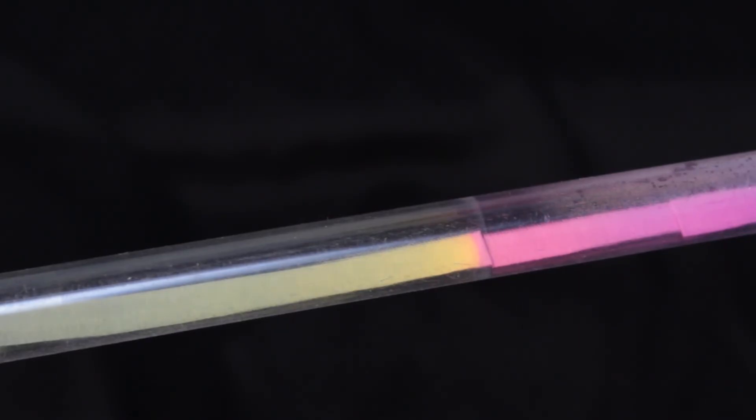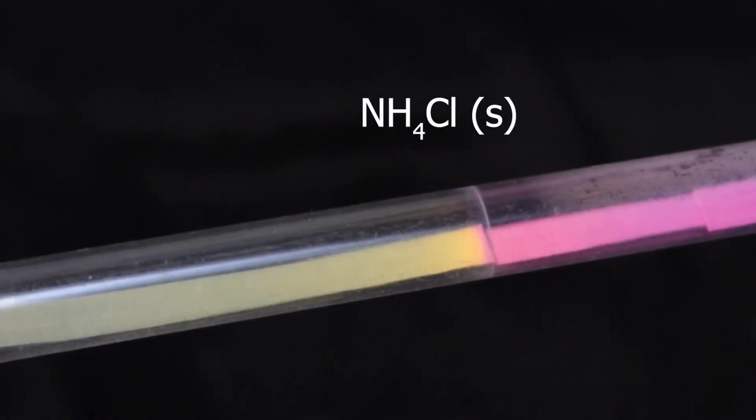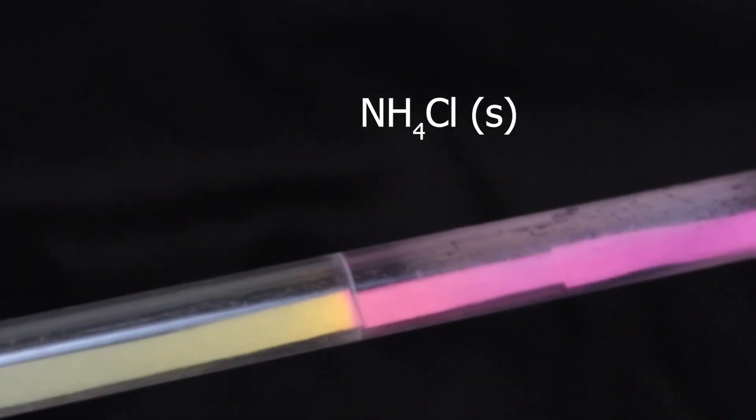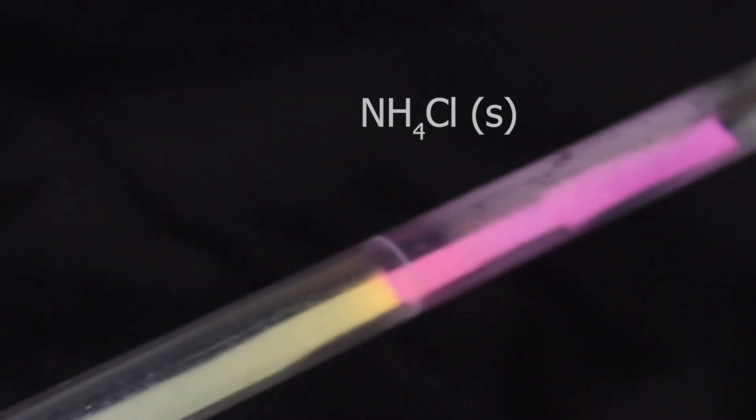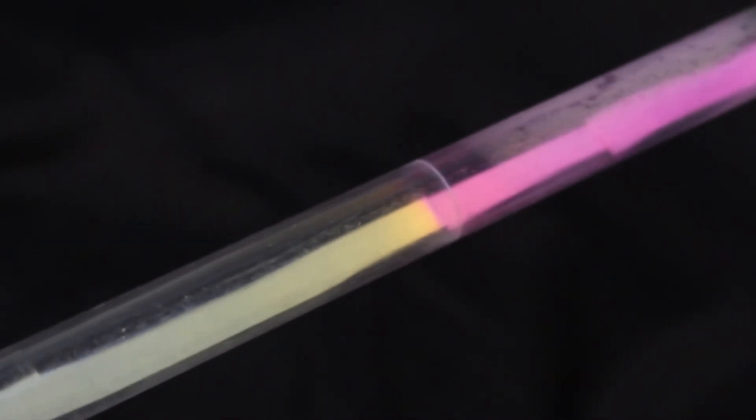You see the formation of white substance at the point where the gases met. This is the same solid, ammonium chloride, which forms, which looks like a white ring.